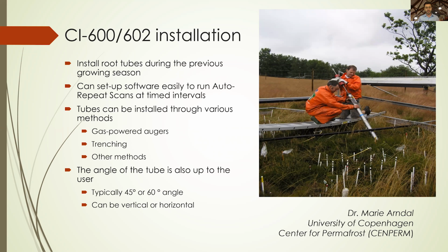And that being said, we have seen the 600s and 602s actually work in an entire variety of different environments. This includes tundra, wetlands, very rocky soil, as well as very sandy or very clay-like soil as well.